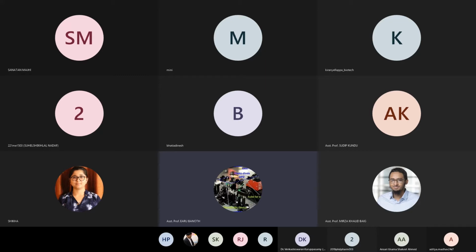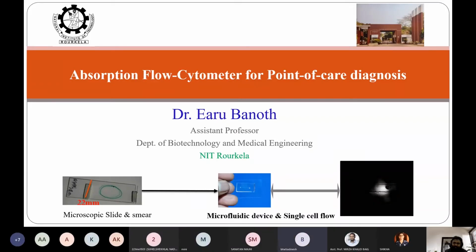which is used for digital holographic microscopy and interferometry. And then I started working on the same digital holographic microscopy for biomedical application, and somehow we found an interesting area: why don't we go for single cell analysis?